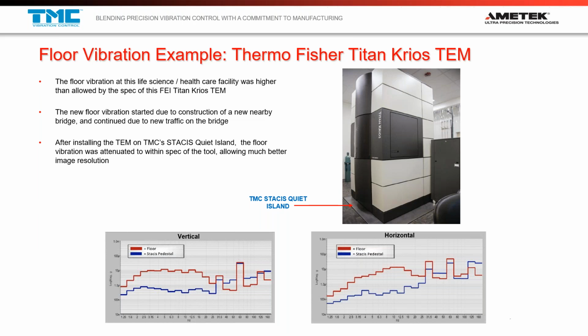So they might run a system for cryo-electron microscopy. It might take a week to get one image, one 3D rendering of some sort of macro biological particle, structural biological particle. I don't have images from this one, but what I do have are the transfer functions. And this is very indicative of the type of performance that you'd want to see from a piezoelectric active cancellation system.